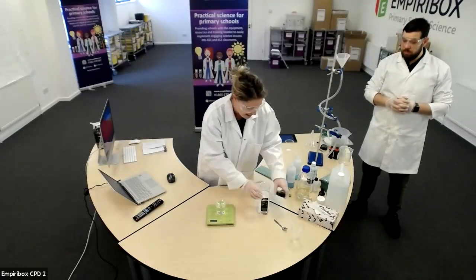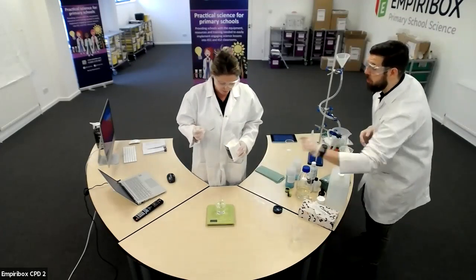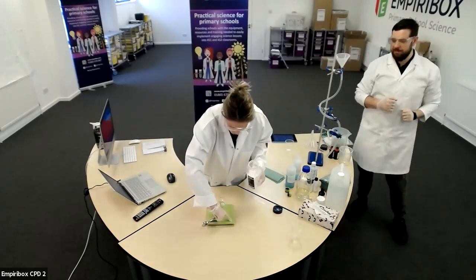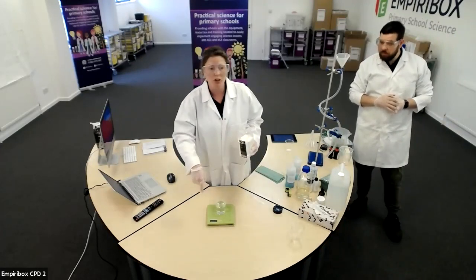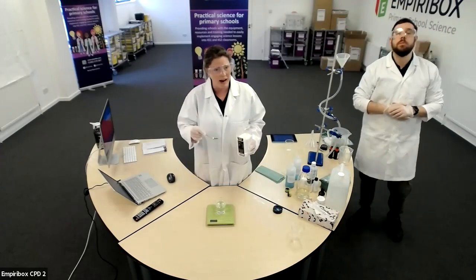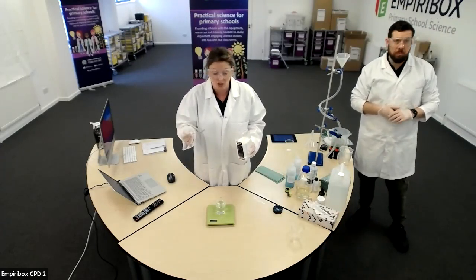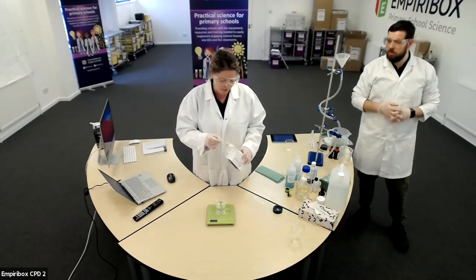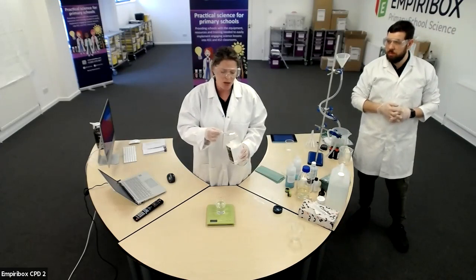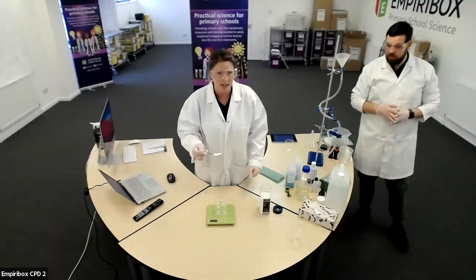So if I then take a quantity of my bicarbonate of soda, and I'm just going to use... Remember to switch on your balance. Oh, yeah, good point. So switch on your balance. And what we want to do is to mark down a starting mass, so what it actually weighs to start off with. What we're then going to do is add a small amount of our bicarbonate of soda, and I'm measuring mine out using a teaspoon. I'm sure that you've probably got a teaspoon available to you quite handy at home.